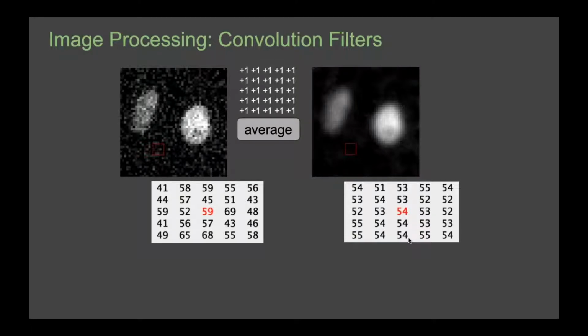If you wanted to have it a bit more in detail, one important word to learn here is the notion of a so-called kernel. As I said, we did a 5 by 5 neighborhood, and that is represented here. So we did a convolution with a kernel of size 5 by 5. And then all these 25 pixels got the same weight, and that's why they all have a value of +1. This is the square average kernel of size 5 by 5.